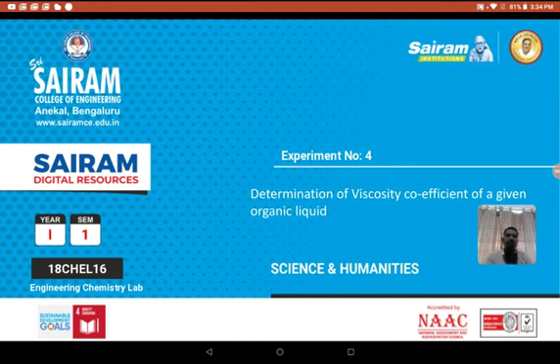We have water. We have alcohol. We have benzene. We have toluene. Isn't it? So each and every liquid or solvent has a different density. Each and every liquid or solvent has a viscosity. So let us today determine the viscosity coefficient of a given organic liquid.